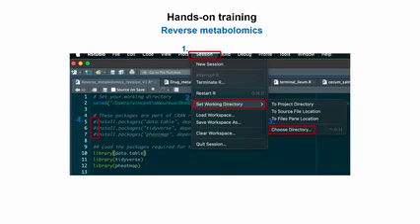And then the first thing will be, if you don't have those packages, please uncomment those lines. So the install packages for data.table, tidyverse, and pheatmap, just uncomment them and then run them individually. So you're gonna install those 3 packages, and then with the library, you're gonna load them. So please, if you're stuck at any point here, or you don't fully understand, just raise your hand and we're gonna come to you. We have different people that can do that.